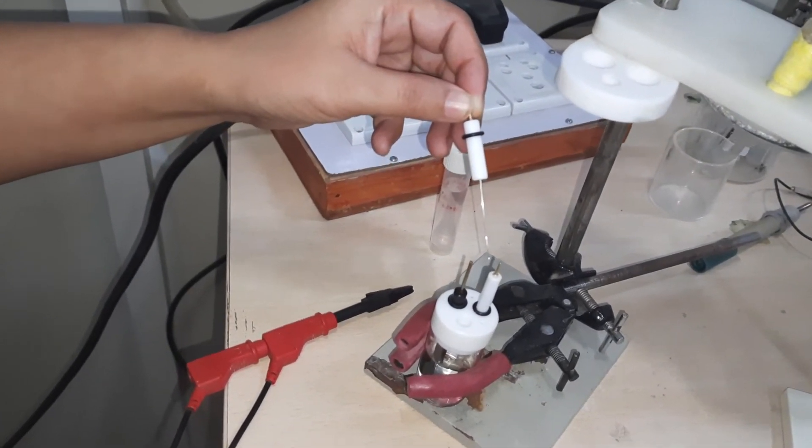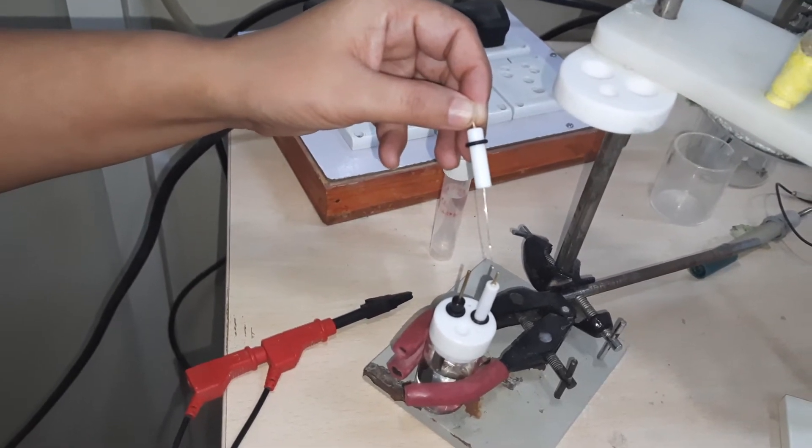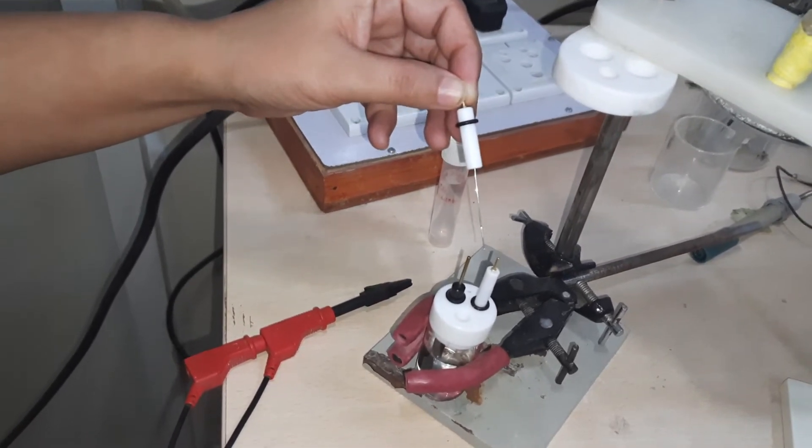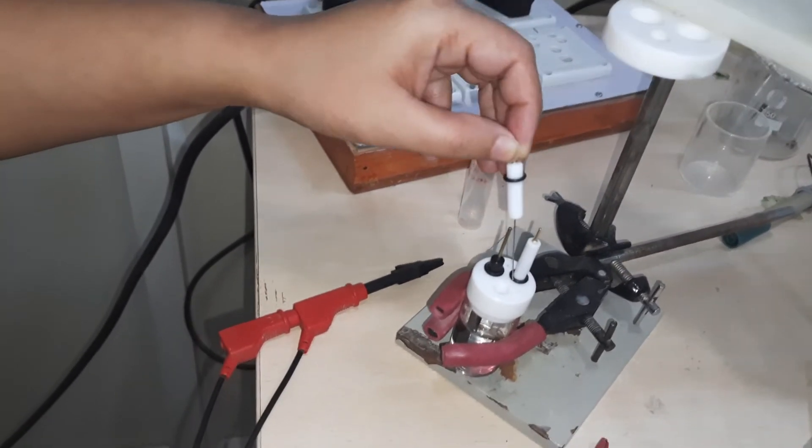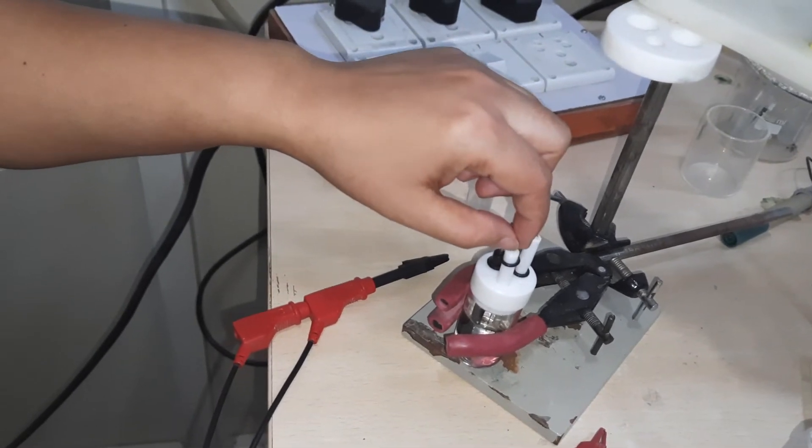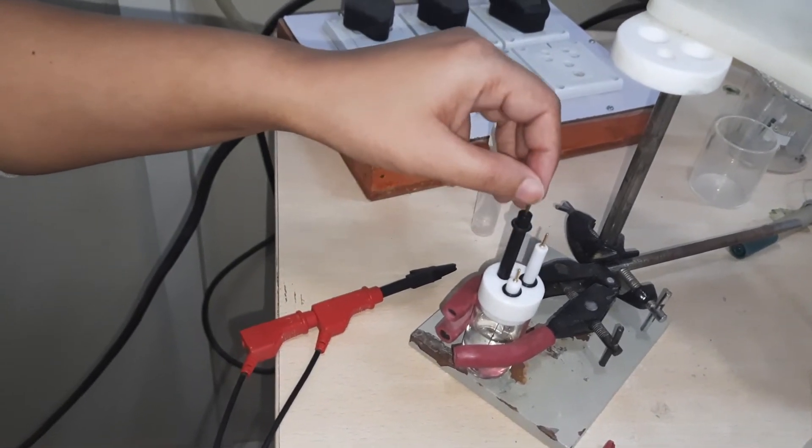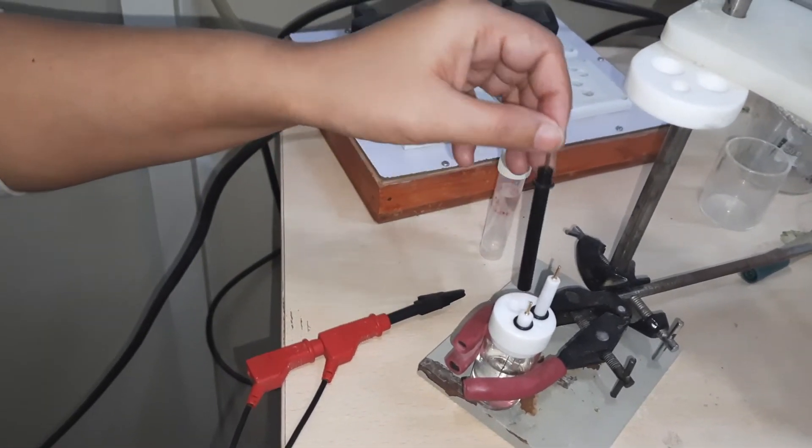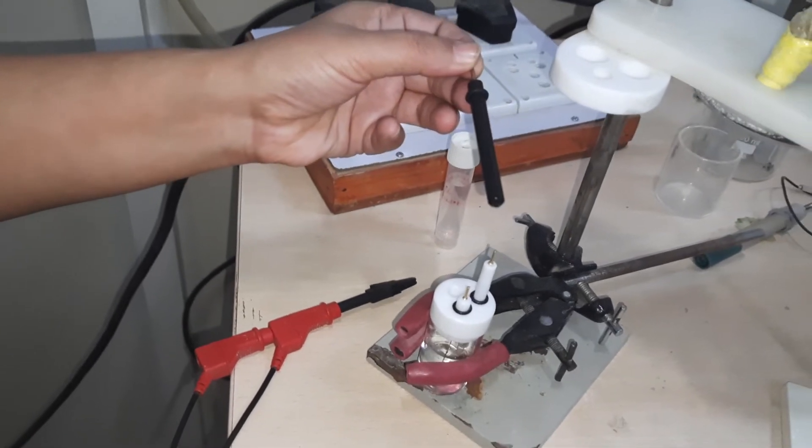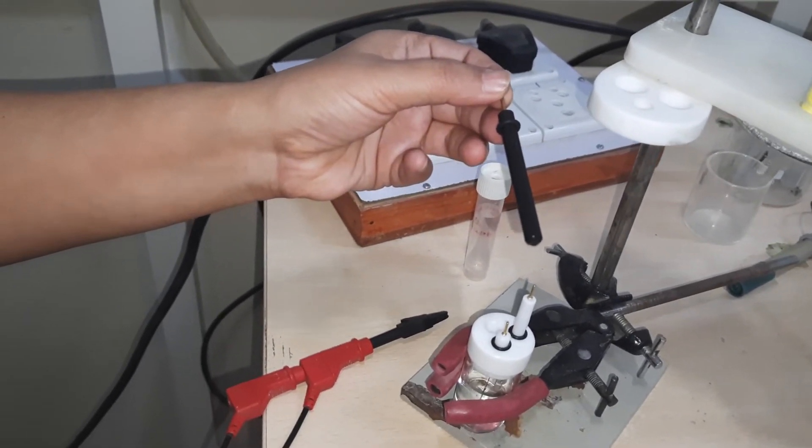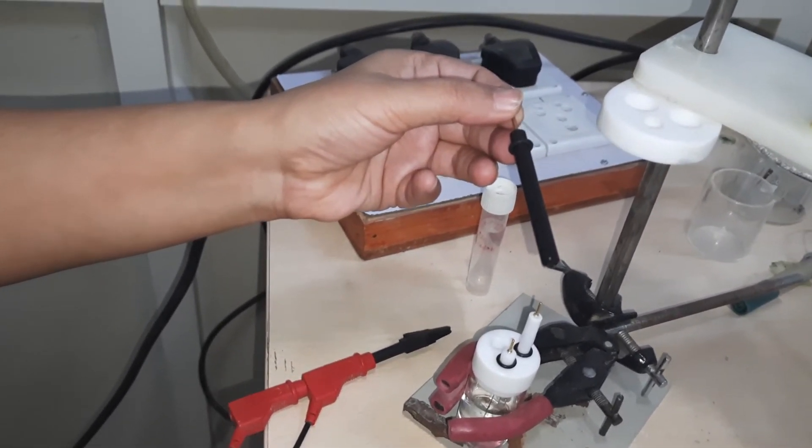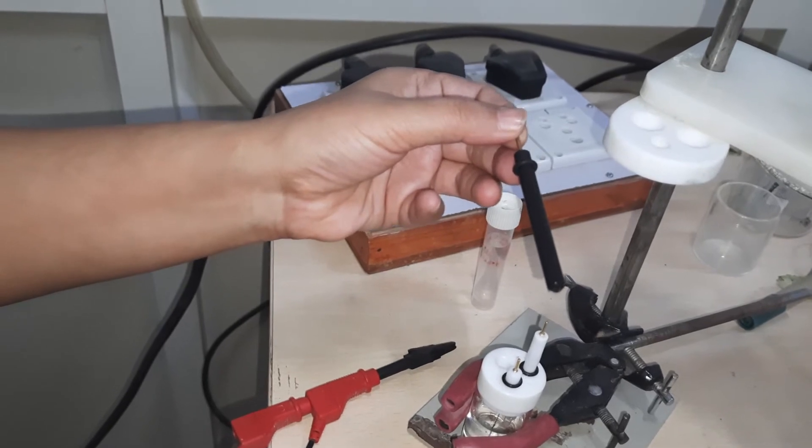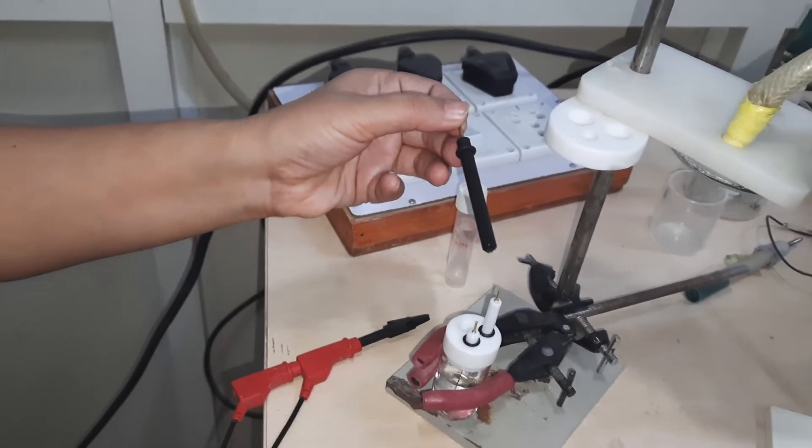I will tell you separately what is the function of this auxiliary electrode. The third one, which looks black in color, is called the working electrode. In this case, today we are using glassy carbon electrode, which is the working electrode.